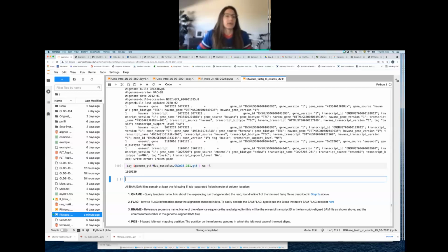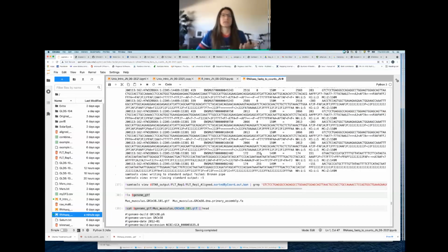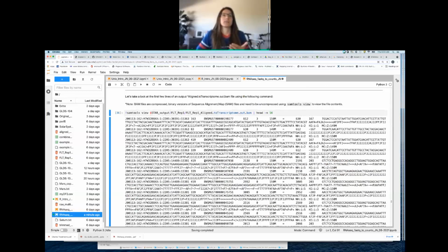And so that's going to be way less than the 60 million we were trying to sort through above. But this, of course, doesn't contain any read information. So what we would have to search for here is one of those transcript names. And so that's why this one maybe takes a little longer, because we'd have to look for each transcript. But if they're all there in the same gene, we would see it.